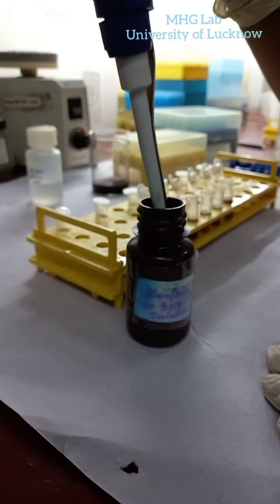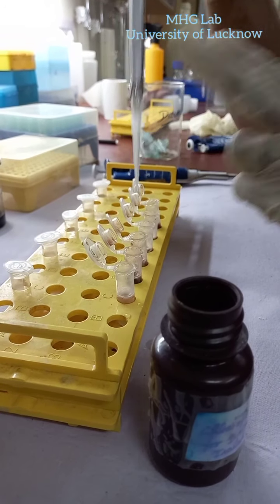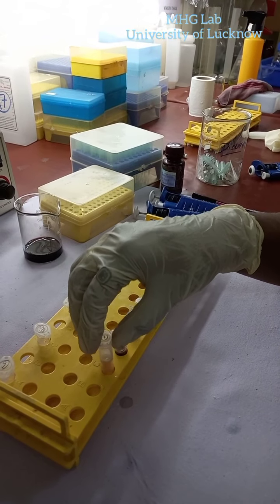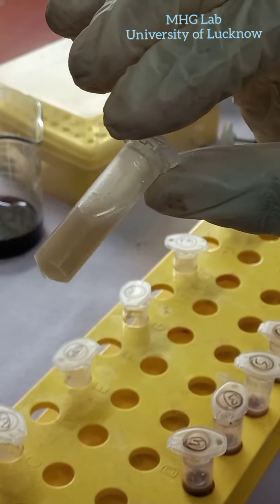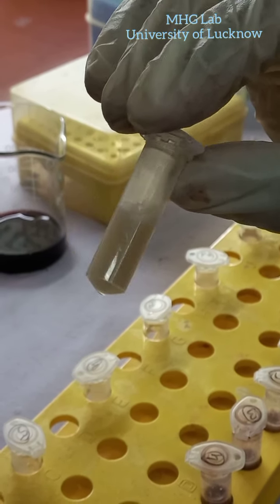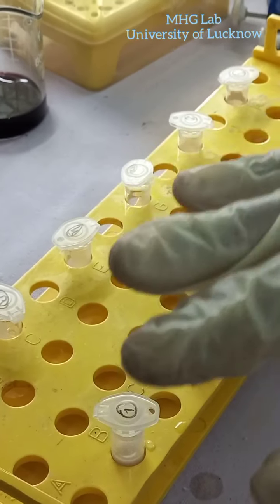Now we will add 100 mcl of chloroform. That is, phenol and chloroform are added in a 4 to 1 ratio — 4 parts of phenol and 1 part of chloroform. This method of DNA isolation is called the salting out method. After adding phenol and chloroform, we just mix everything gently like this. We do not apply pressure, otherwise our genetic material will get sheared. To keep the DNA intact, we just mix it gently and keep it for 1 minute, then centrifuge for 15 minutes at 10,000 RPM.